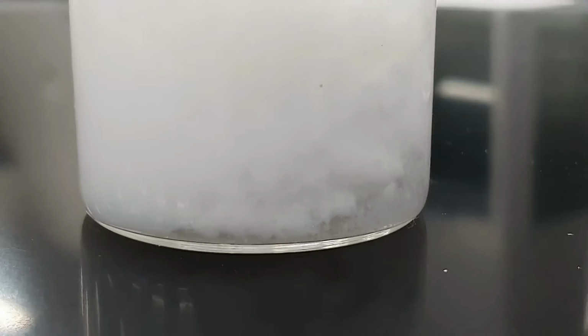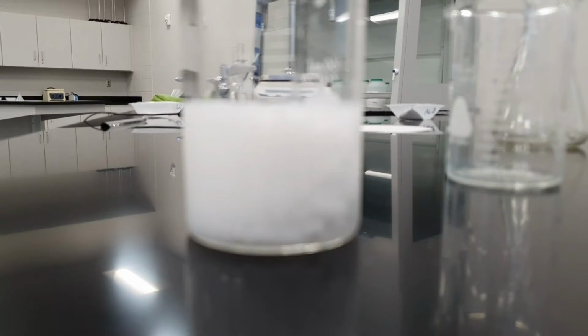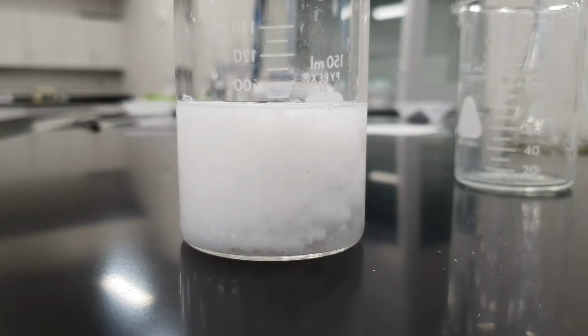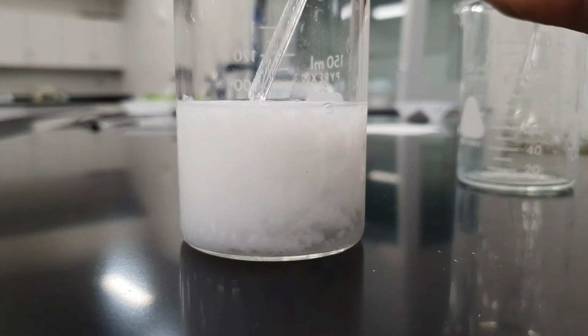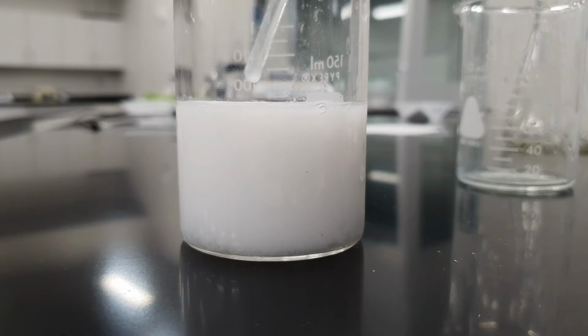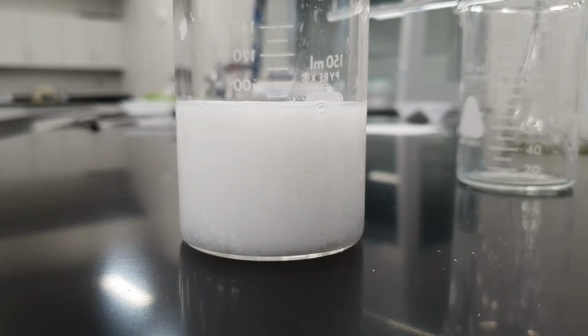All right. So I would say, taking a look at that, that looks to be a chemical reaction to me. We mixed two clear solutions together, and we came out with something that is rather cloudy looking now. So if I mix that up, it feels like there's some powder in there. All right. So yes, I would say that is a chemical reaction. We had those two solutions. Now, the next step, if we're following along with our lab, is we're going to filter it. So I'll be back in a second, ready to filter this.